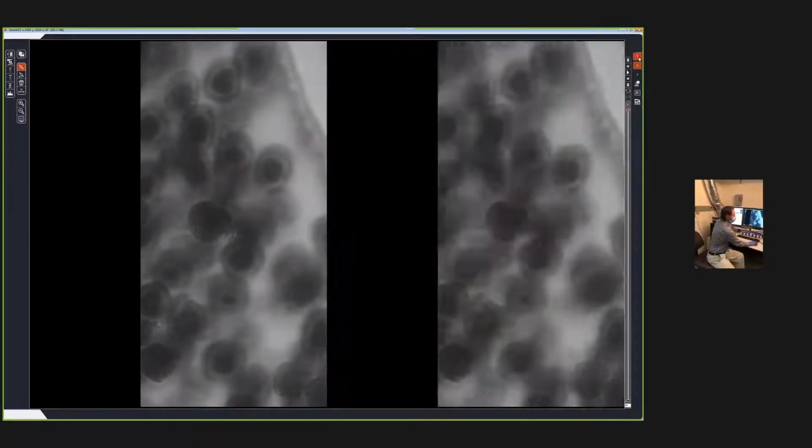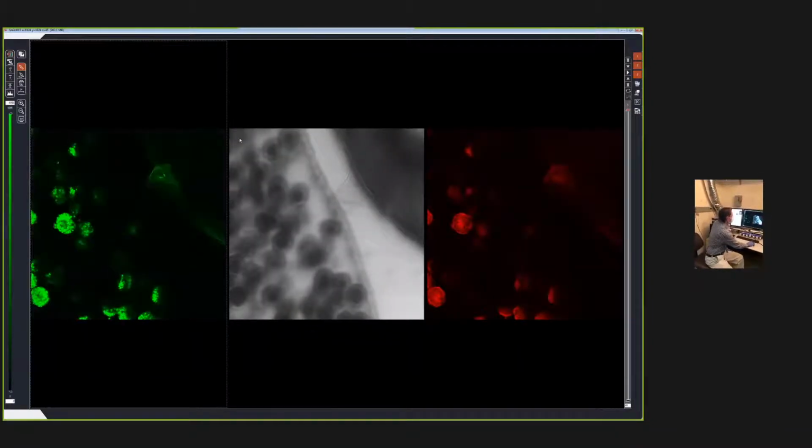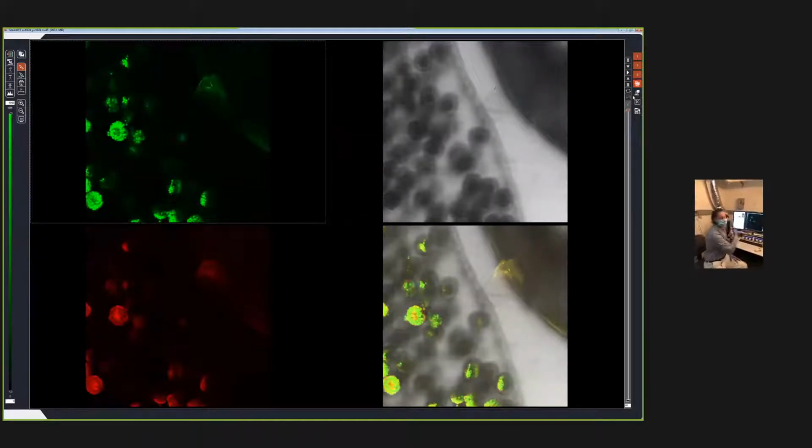With this microscope, we're able to do two things. One, we're able to use color. By collecting two different colors from the sample, we're able to separate out different components. We also have the advantage, compared to, for example, the atomic force microscope, that we can look directly through the sample, slice by slice inside, almost as if we have X-ray vision.